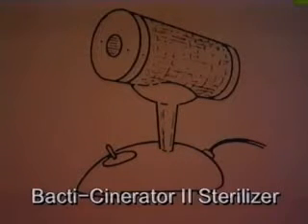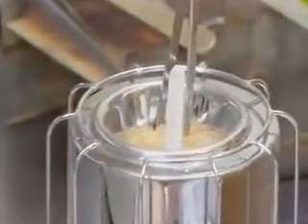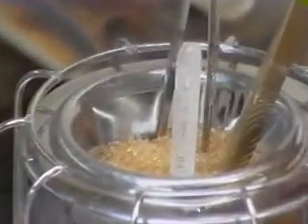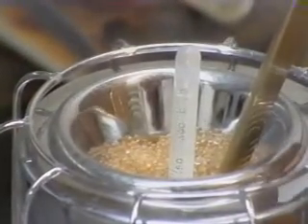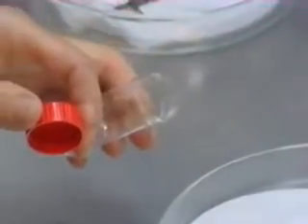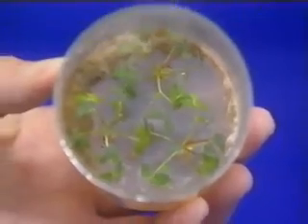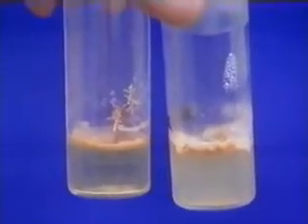No matter what it is called or what you use, the objective of all these is to kill any microorganisms which may have survived the process of surface sterilization of the plant material. At the initiation stage, it is desirable to use small vessels and put only one explant into each vessel. The reason is that if you use larger vessels with more than one explant, and one of these explants becomes infested, you must discard the whole lot, whereas in a small vessel, you contain the infestation to that explant only.